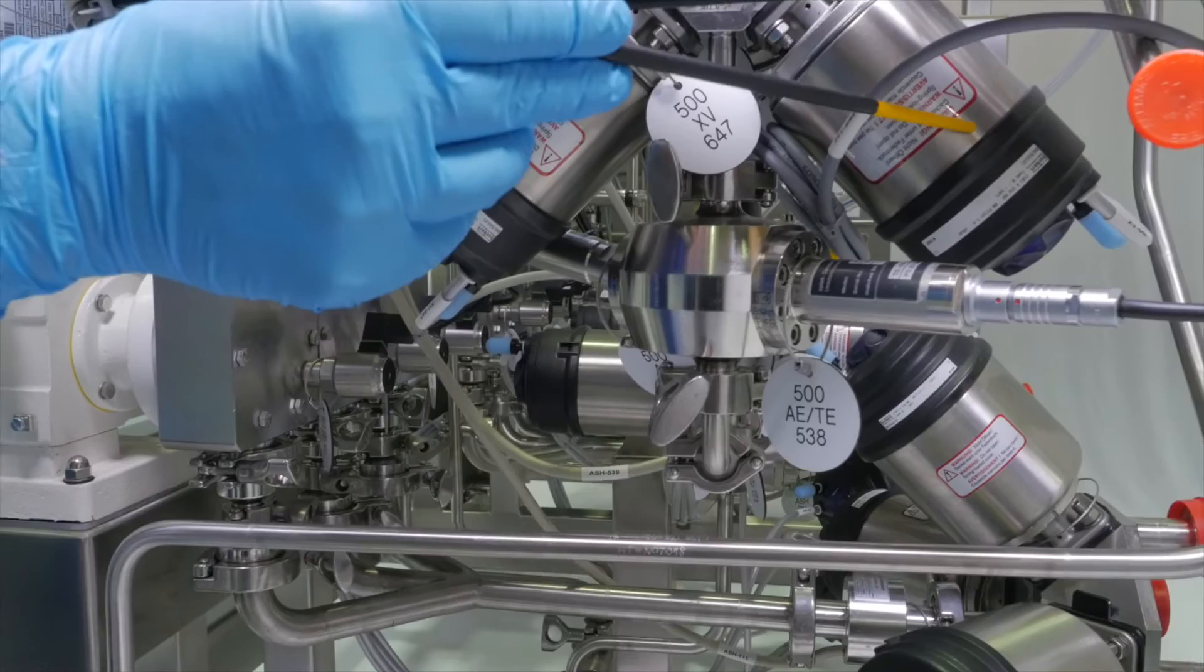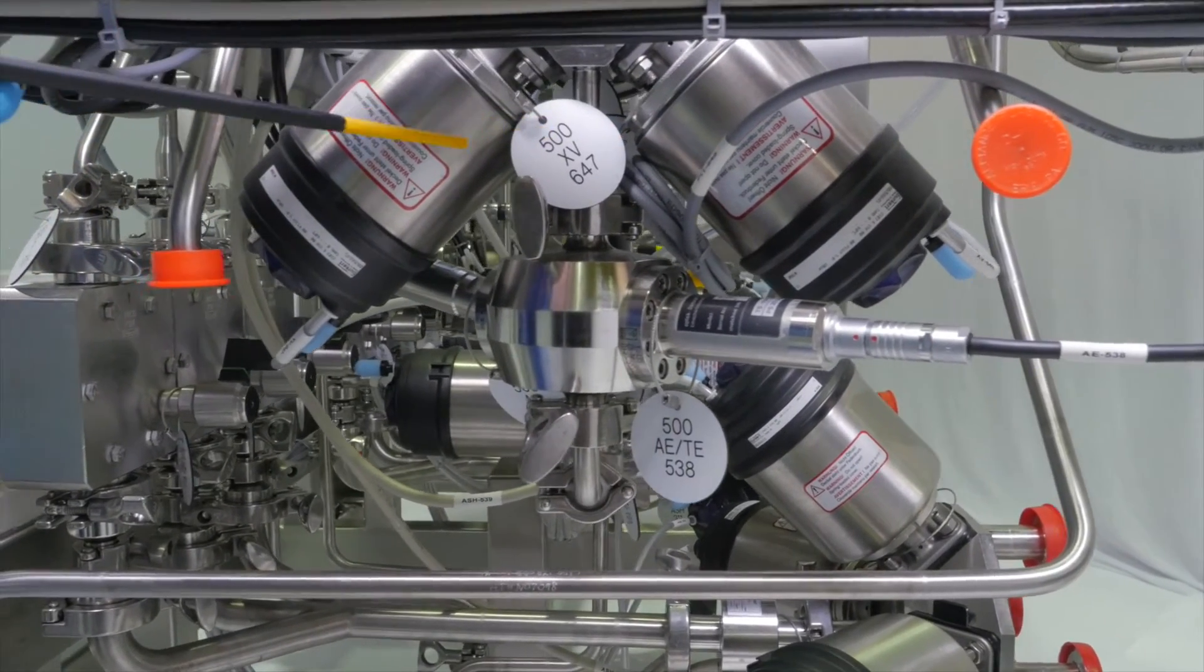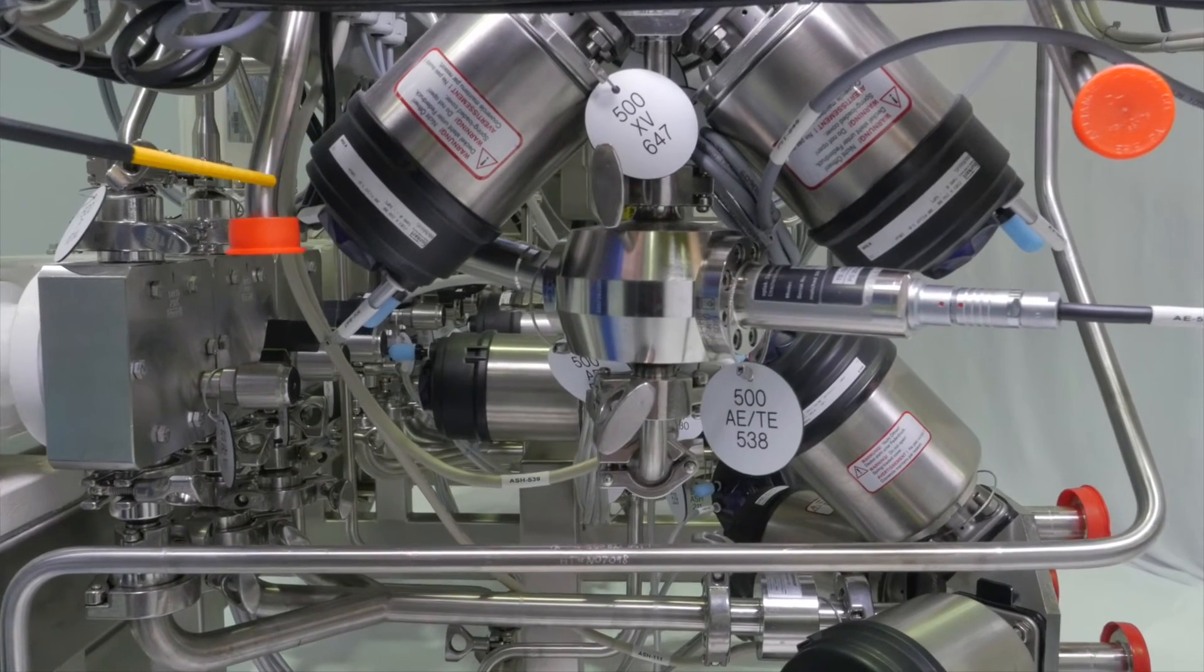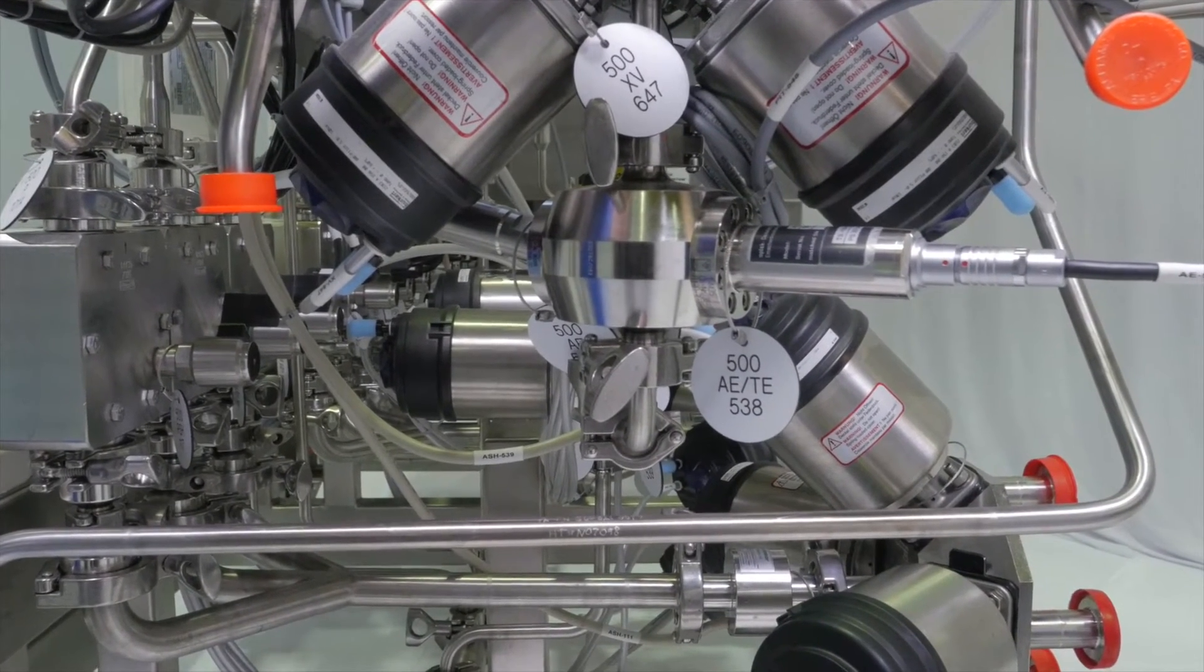The chromatography block valve directs the flow to the top of the column for loading, elution and washing, to the bottom of the column for reverse flow for column regeneration, or to bypass the column to waste.